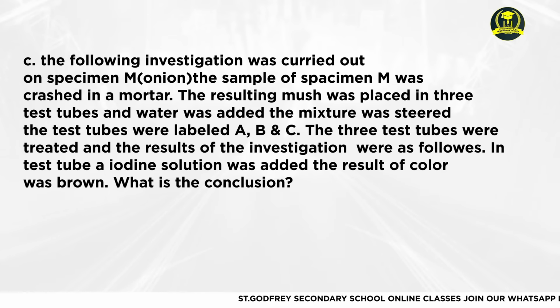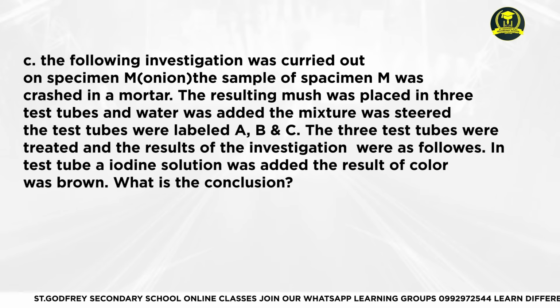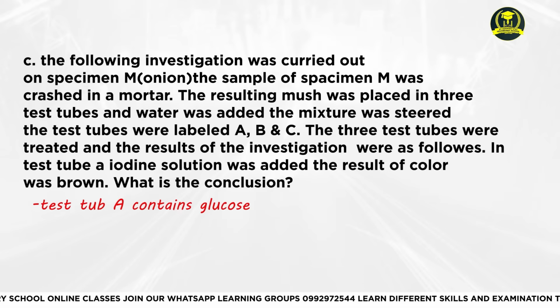The 3 test tubes were treated, and the results of the investigation were as follows. In test tube A, iodine solution was added. The result of color was brown. What is the conclusion? Test tube A contains glucose.